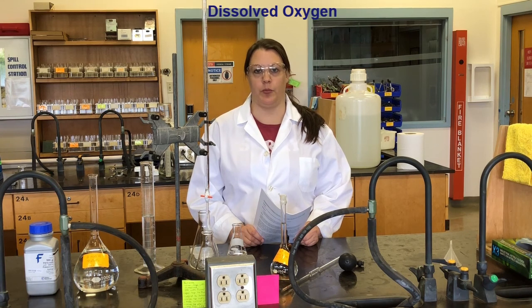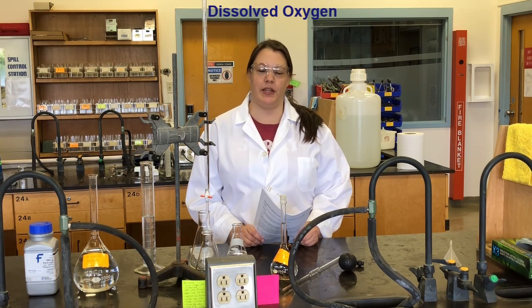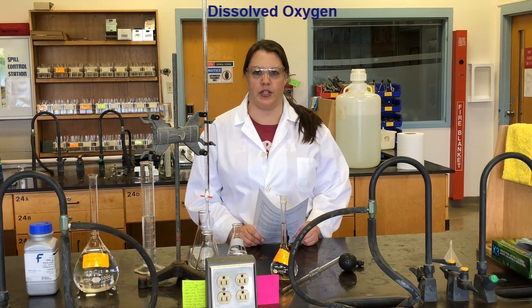Everyone. So in today's lab, we're going to be looking at measuring the dissolved oxygen content of some water samples. There are many different ways that we can measure the oxygen content in water. We can use things like electrodes, probes, oxygen meters, but today we're going to be doing a titration. And even though titrations may seem time-consuming, it does give us very accurate and precise results. So it is beneficial to use a titration if we have the time to do so, which of course we do today.